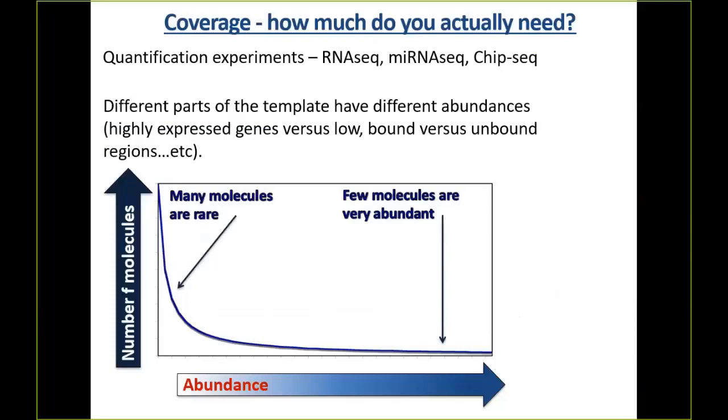So even though she was sequencing literally the whole mosquito, she still got less DNA in there than even a bad human sample. So she had to do a lot of PCR and basically amplify up the genome. So she got ultimately the same number of reads as anybody else would get, but she also figured out that a lot of those reads were basically PCR duplicates, or things that were artificially over amplified. I'll go into what those mean later.